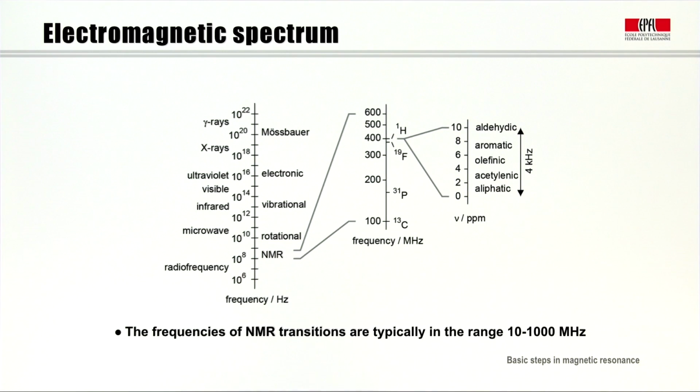So this has several consequences. First of all, the radio frequencies are largely innocuous. Nobody really worries that when you listen to a transistor radio on the beach that you might get irradiated by the transmitters or by the receivers. So radio frequency is quite innocuous, and that has great advantages for MRI. Radio frequency can also penetrate through all sorts of tissues, including living humans.